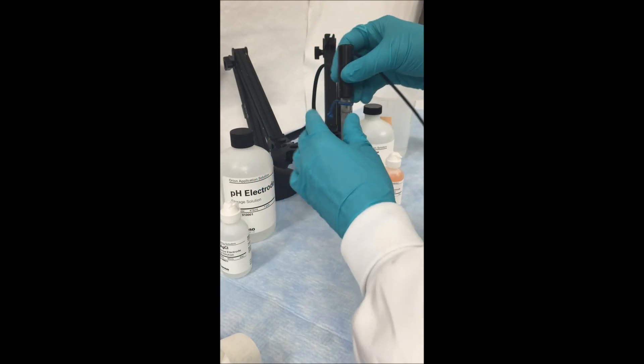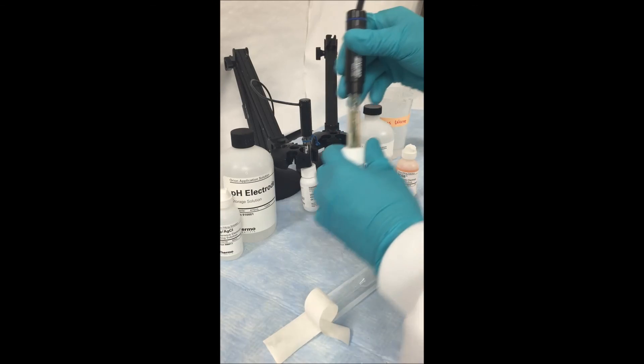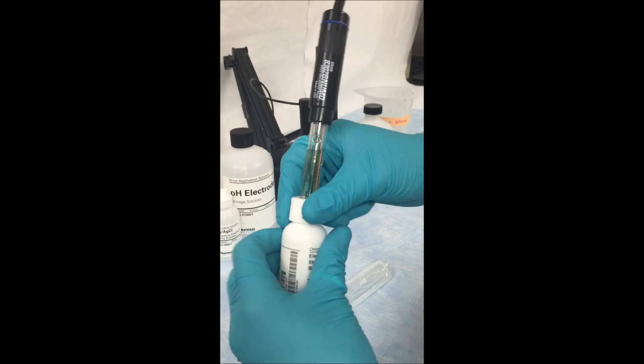The next segment of this video will show you how to refill a non-sure flow electrode by first draining it and then filling it. We are going to demonstrate how to remove the fill solution from a non-sure flow electrode by using a glass-bodied Ross electrode.